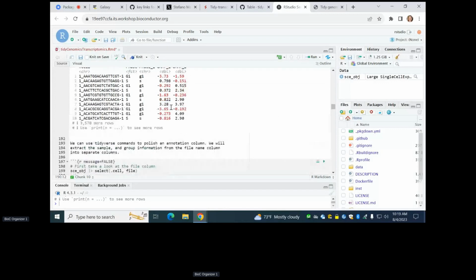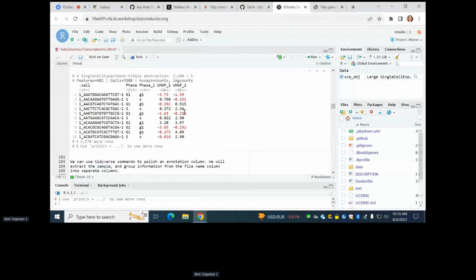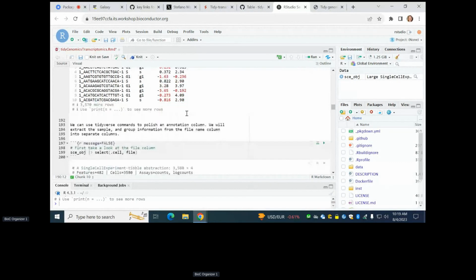Yeah. By default, we cut, for example, PC up to 5, but you can display them all. And it's not that inconvenient, as you can have a very big table and the columns that are not printed here, the names are printed downstairs. So in practice, it's a good solution. I found at least. So will it cut everything to 5 by default? By default, yes. The display, yeah, but you can toggle to print everything.